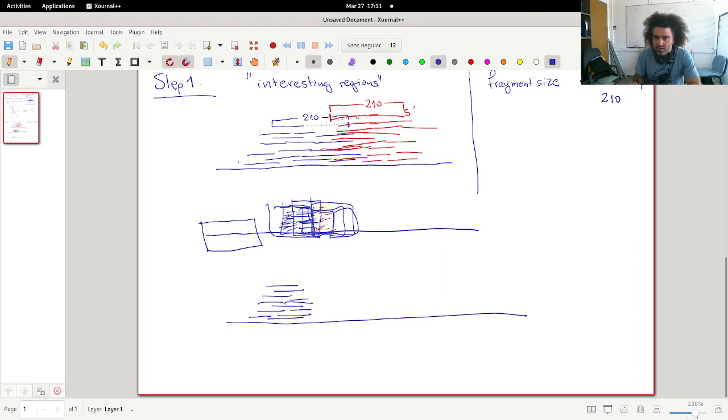High depth here and lower depth here, after the extension. Then we have some noise here, some reads that do not form a peak, and then perhaps here we have again such a significant region, and so on and so forth.